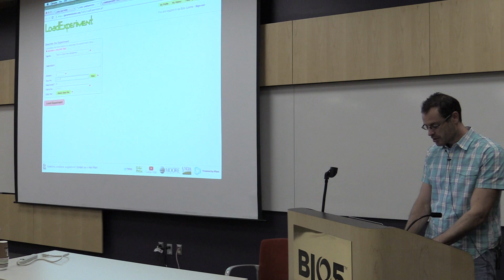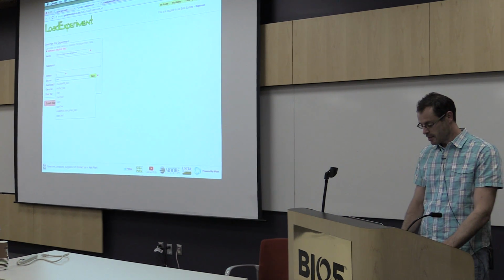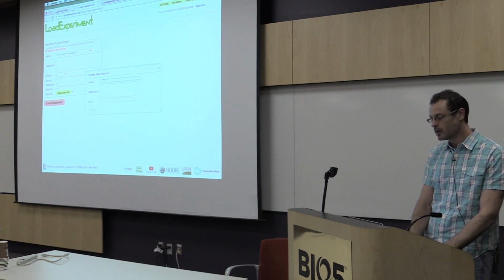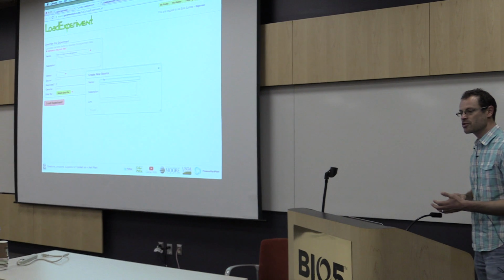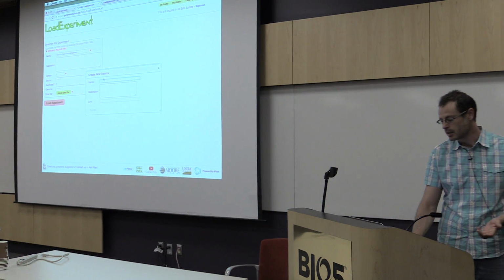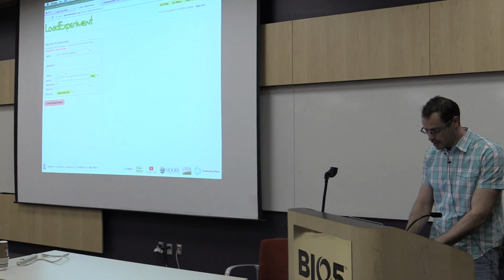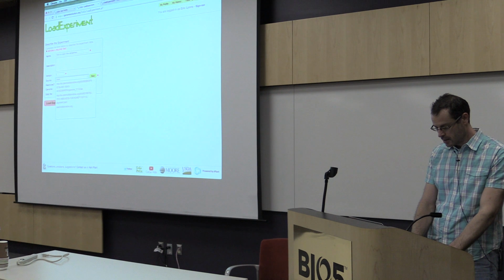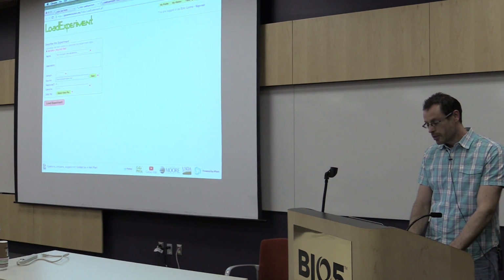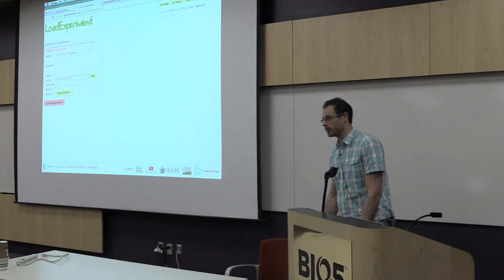If you go ahead and search, for example, if I search for the word test, there's a bunch of things with the test in there. If I need to create a new data source, I can go ahead and click on new. And this gives you a chance to add a name, description, and link. So if it's out of your lab, and your lab's not listed, or some other source out there. So here, I'll go ahead and say that this came from iPlant, iPlantcollaborative.org, why not? Restricted, whether or not these data are going to be made public. Do not make these data public.